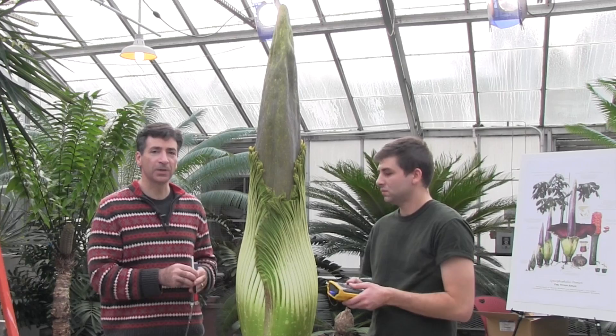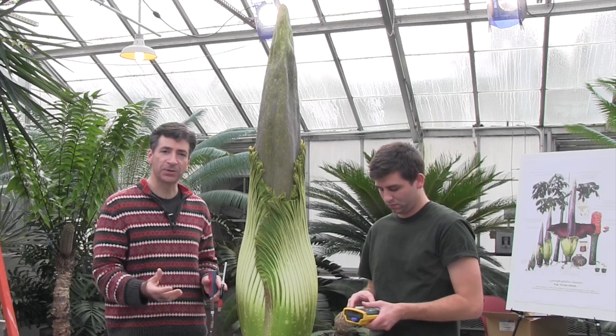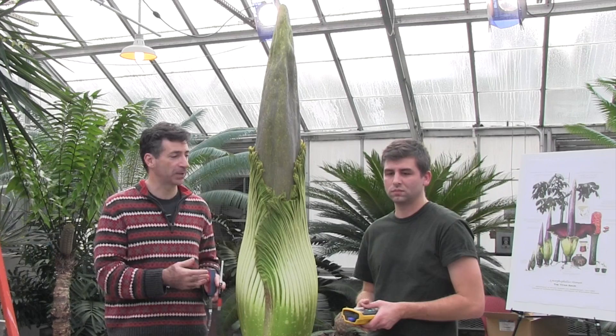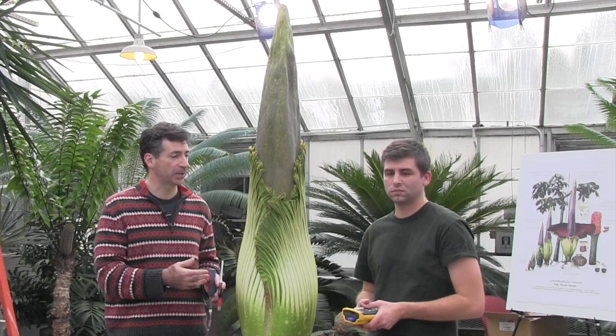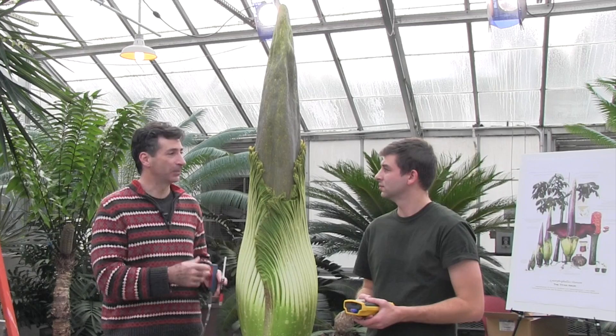One reason for being interested in that: we know from thermal imagery that these things really heat up just as they're producing the largest release of volatiles. The insects that are attracted to these flowers experience all of that at once — the heat inside the chamber, the carbon dioxide as the plant is respiring like a sprinter, and these very strong information-rich volatiles that flies and beetles attracted to this plant find meaningful, because they are simulating the cues emanating from a rotting corpse. We'll be doing that around the clock as the flower opens, surreptitiously collecting our data and posting it as we go.